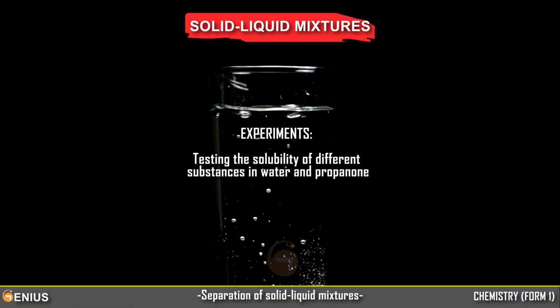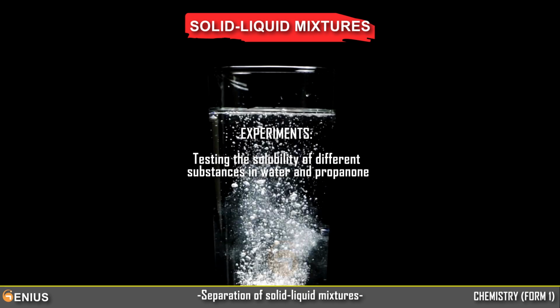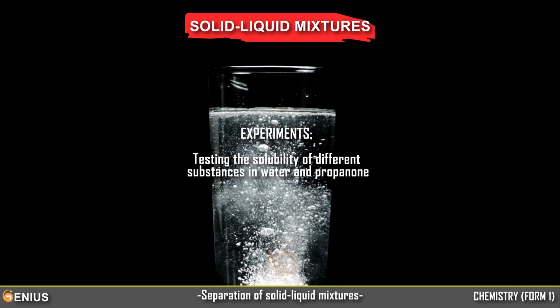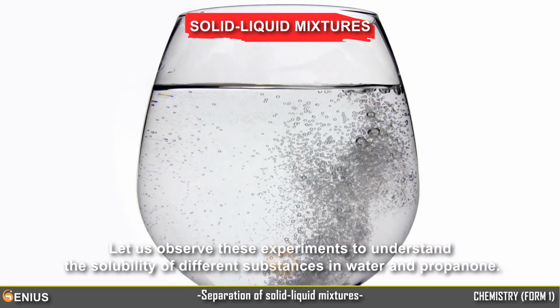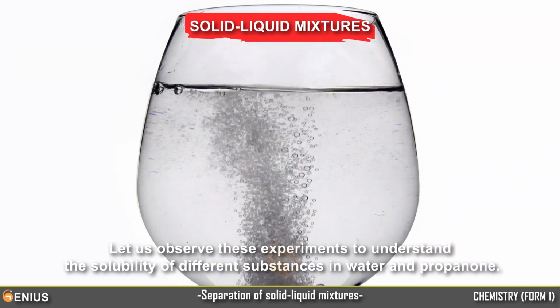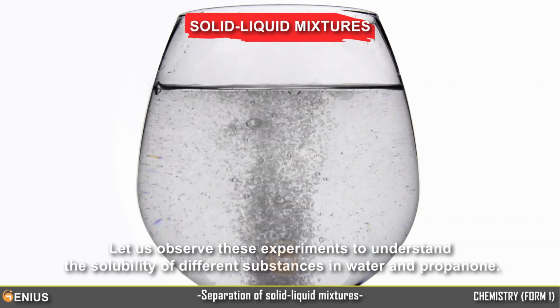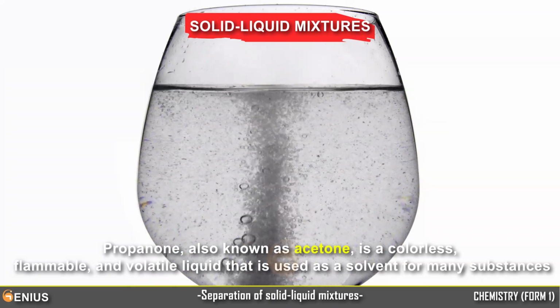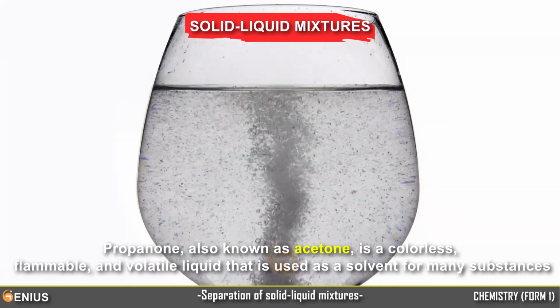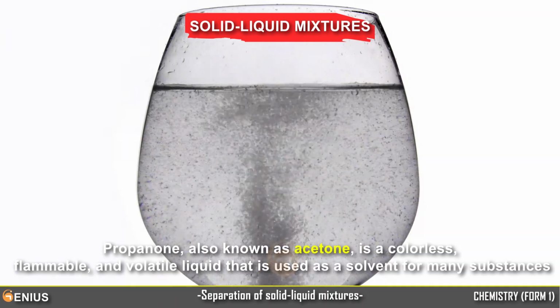Experiments. Testing the solubility of different substances in water and propanone. Let us observe these experiments to understand the solubility of different substances in water and propanone. Propanone, also known as acetone, is a colorless, flammable, and volatile liquid that is used as a solvent for many substances.